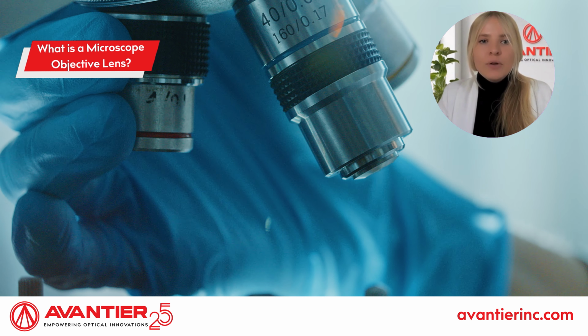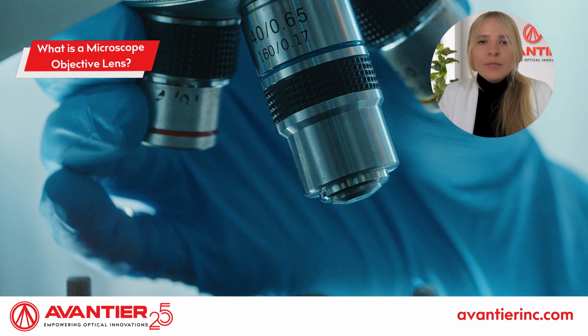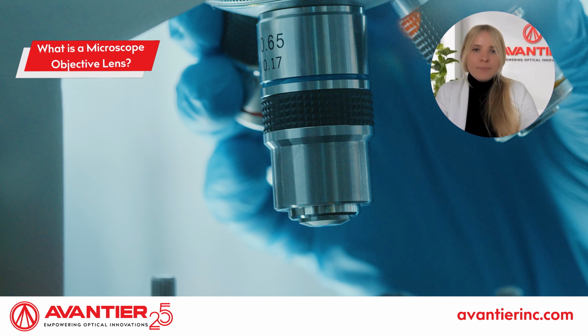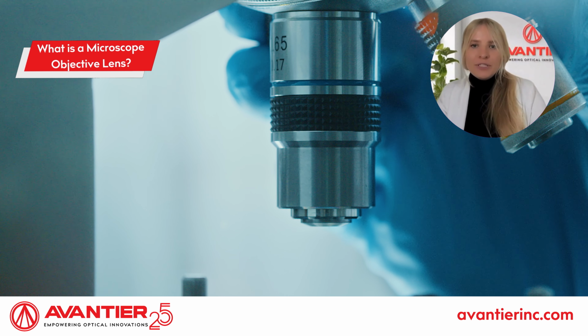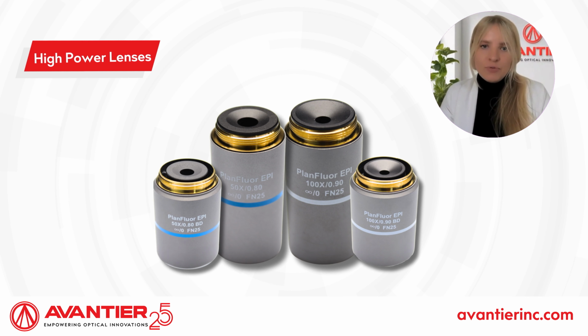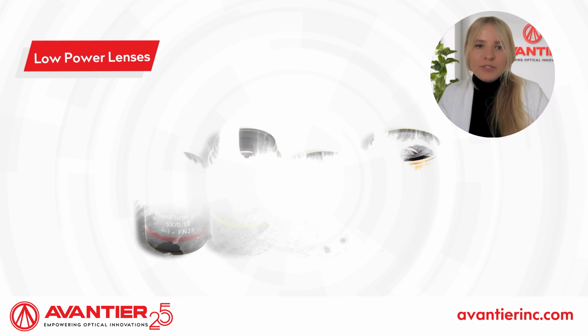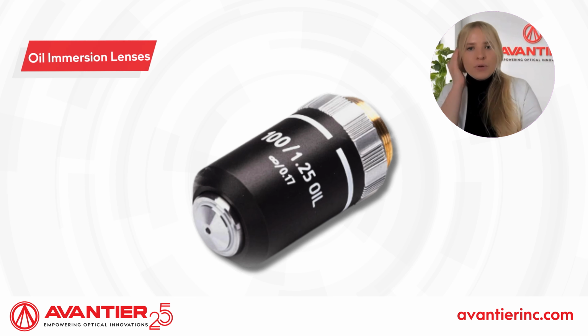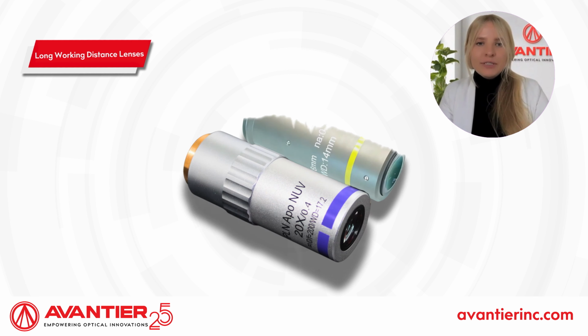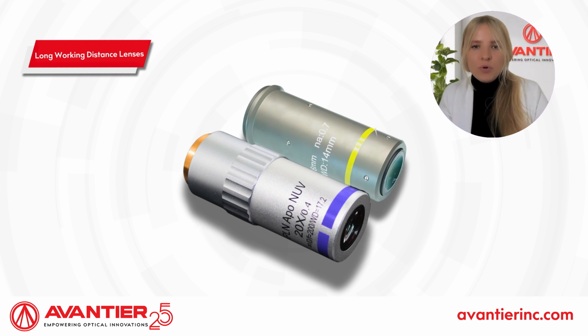Objective lenses are vital optical components in microscopes, designed to provide detailed and precise observation of specimens. Manufacturers offer a variety of designs tailored to specific applications: high-power lenses for detailed observation, low-power lenses for broader views, oil immersion lenses for high-resolution imaging, and long working distance lenses for examining samples through thick glass walls.